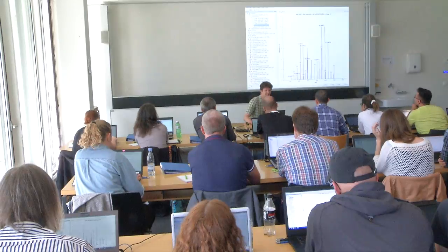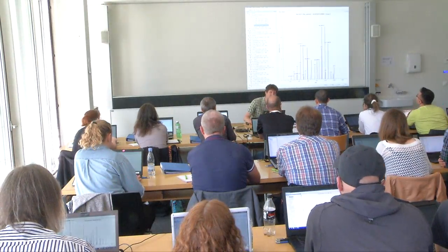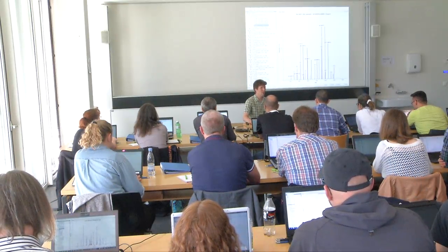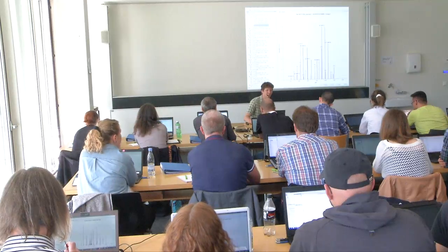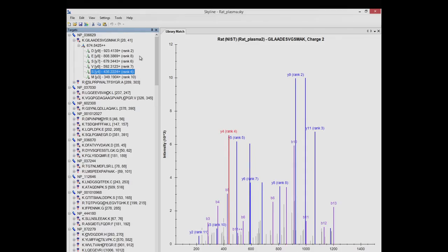So you can see that the set of transitions that are currently chosen were not chosen from this library the way you have been working with things recently. These are the transitions that appeared detectable to Daniela when she did the detection level experiment.